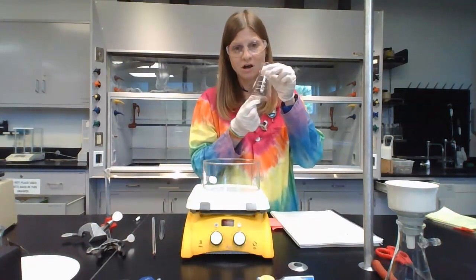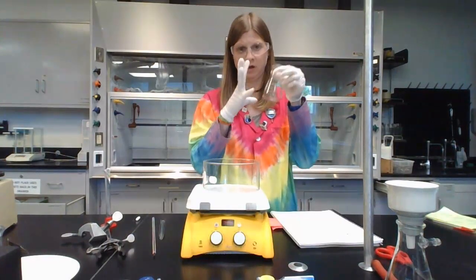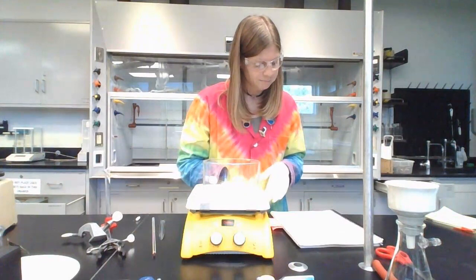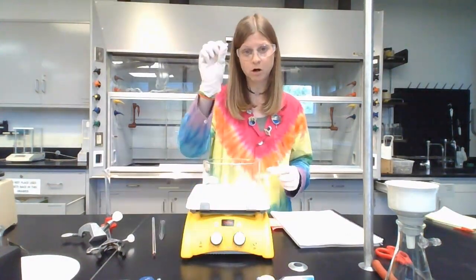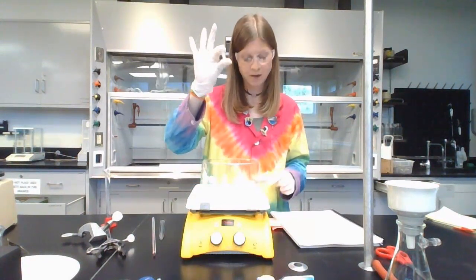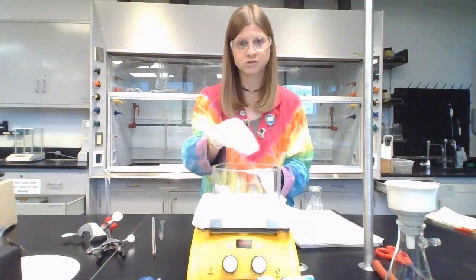So at this point, we have a lot of solid and tiny bits of liquid. Okay, so it's not like it's full at this point or anything. So what we need to do is we'll let this react. So we're going to use a stir bar, same kind of stir bars we've used in the past. We're going to drop it in there. And then hopefully at this point, your water bath is ready to go.